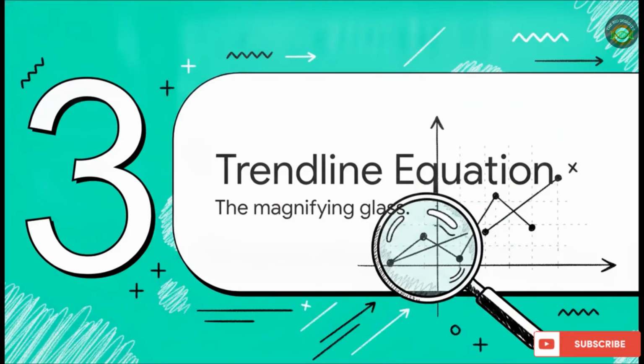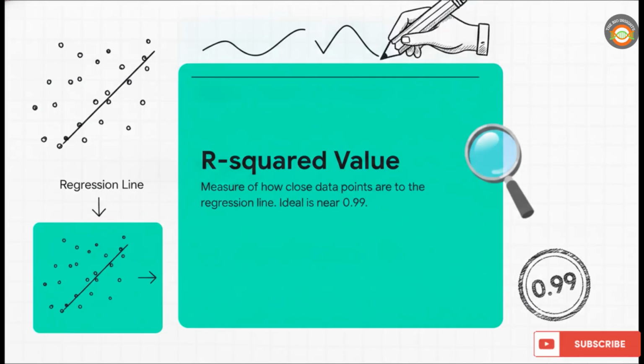Part 3. Unlocking the trendline equation. Our magnifying glass. You might be wondering, why do we even need a trendline in the first place? Well, it acts as our mathematical magnifying glass to predict values we haven't directly tested. And a massive part of that is the R-squared value. This is a statistical measure representing how close your physical data points are to that fitted regression line we just drew. It's essentially the ultimate quality check for your lab work.